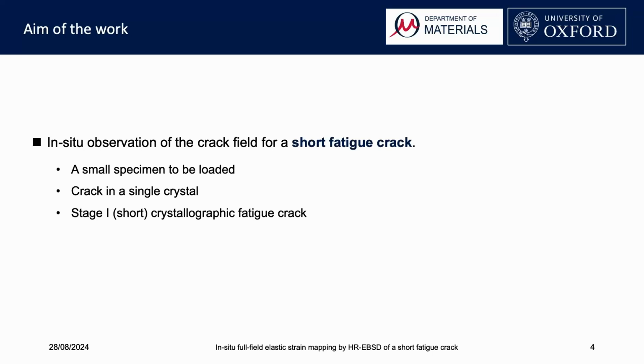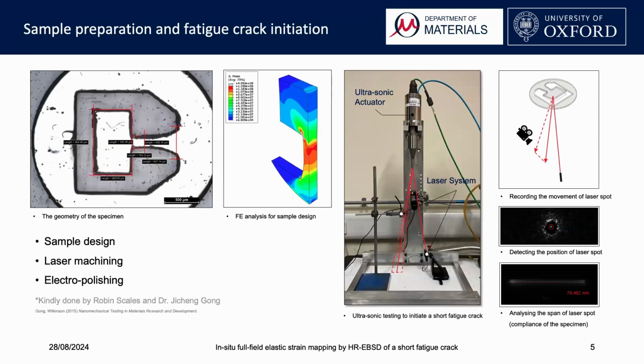The objective of this research is to observe the short fatigue crack field in situ. To achieve that, we need to load a small specimen directly in an SEM, and it's ideal to exclude other influencing factors. It's ideal that the crack exists in a single crystal, and it should be a stage 1 short fatigue crack demonstrating interesting crystallographic properties. So now I'll discuss how to prepare the sample and test it.